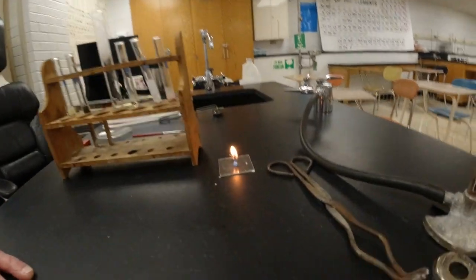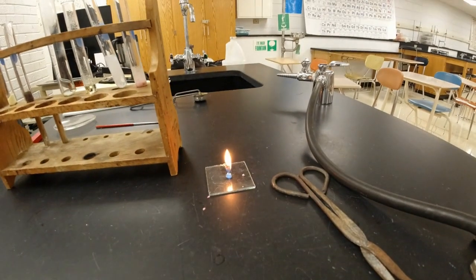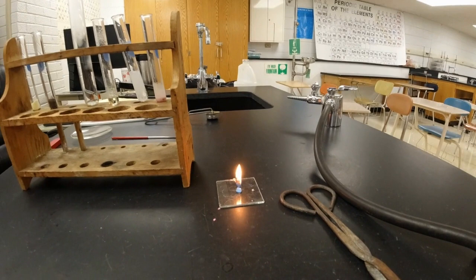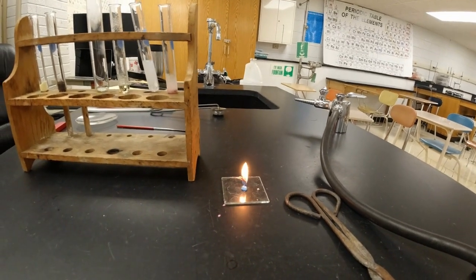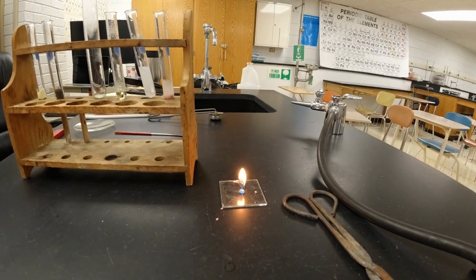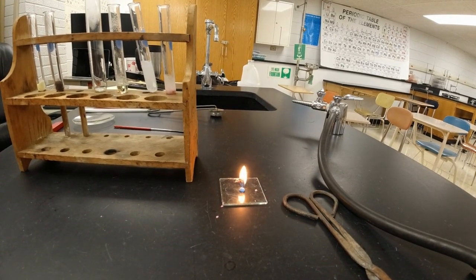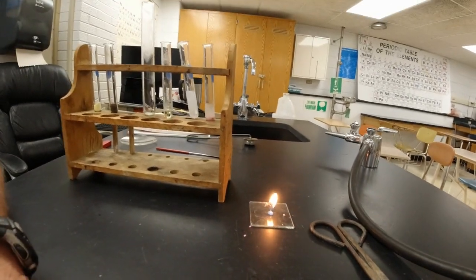Meanwhile, look at our candle. The candle's just about gone. And it won't take very long for that to be completely gone. All right, so while that blue crystal is cooling off, and I'm going to put some water on it again in a minute, but we're going to look at the next step here.